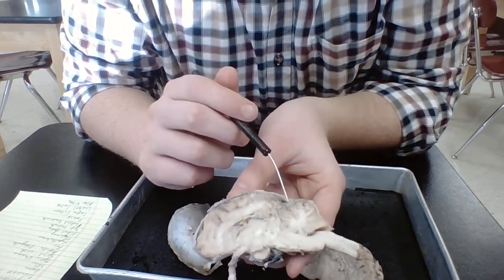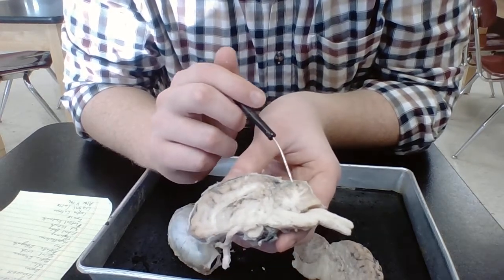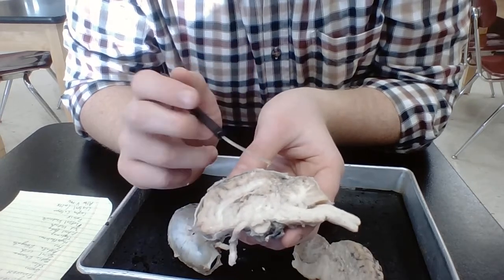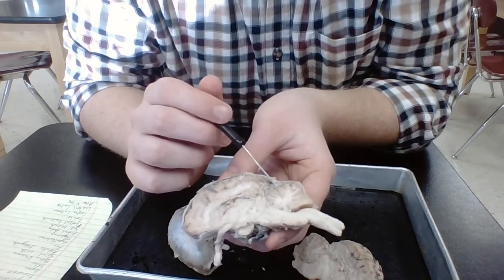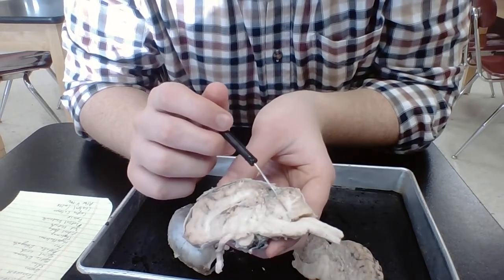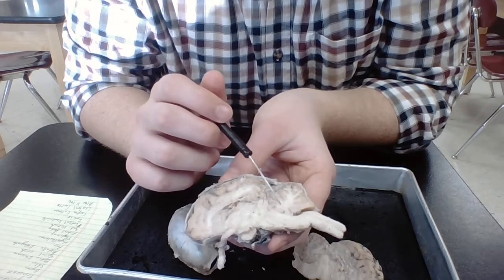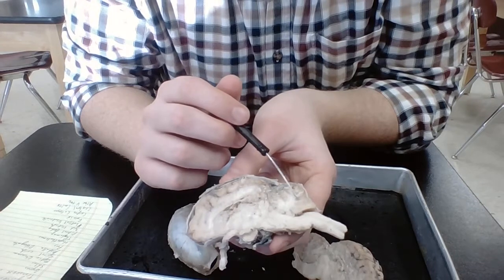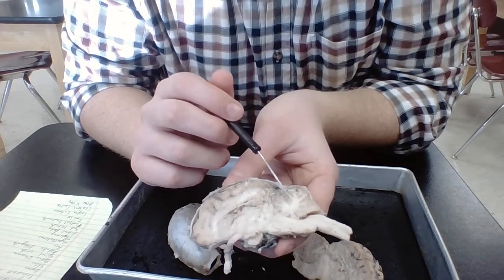Lastly, but not least, we're going to talk about the cerebellum. So this is that structure behind here. This controls a lot of your coordination of body muscular activities, skeletal muscle activities. And this thing right here looks almost like a tree with different branches coming off. So this is called the arbor vitae, which means tree of life. So we can think about little branches going off and branching in different parts.